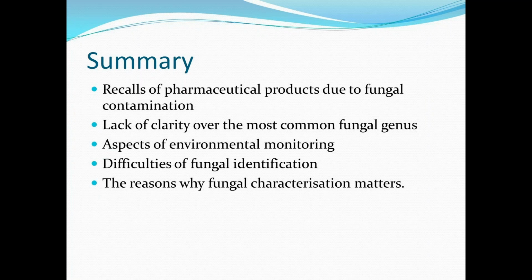We've looked at aspects of environmental monitoring and clean room control and which are the most common fungi found in clean rooms, and linked that back to the pharmaceutical product recalls. We've also looked at aspects of environmental monitoring, which are the best agars to use, and the difficulties of fungal identification, and wrapped up to say why fungal identification matters.